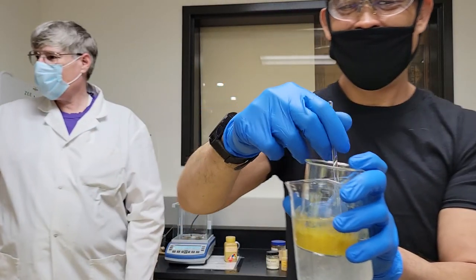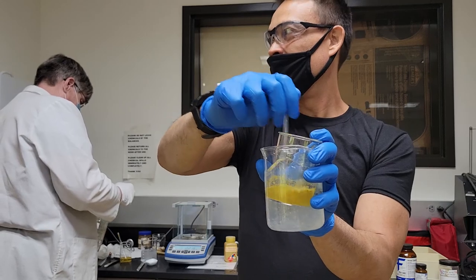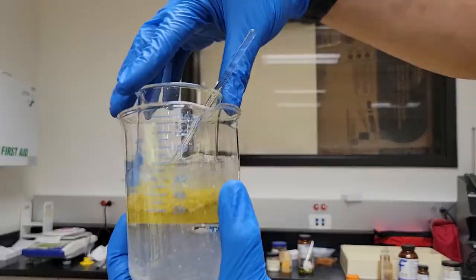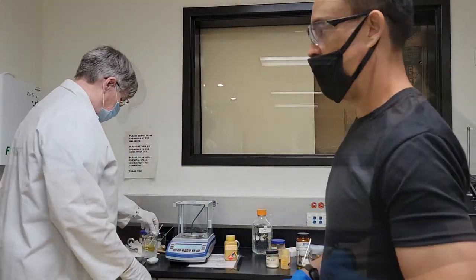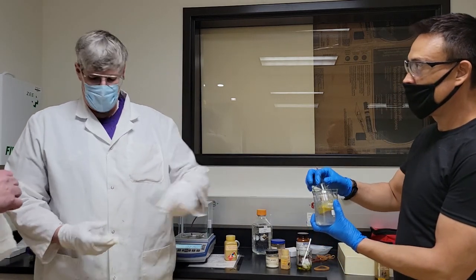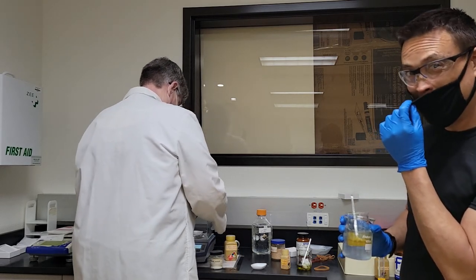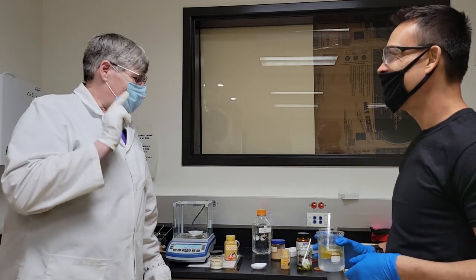Dr. Garner is here to make a cameo. We're going to have Dr. Garner fold up a piece of cheesecloth. So the ingredient that changes the aniline into a diazonium is sodium nitrite — we're going to use about a gram, which is what the procedures say. For those in my class, that's the HONO reagent. If you ever write HONO on a test, you get a point taken off.